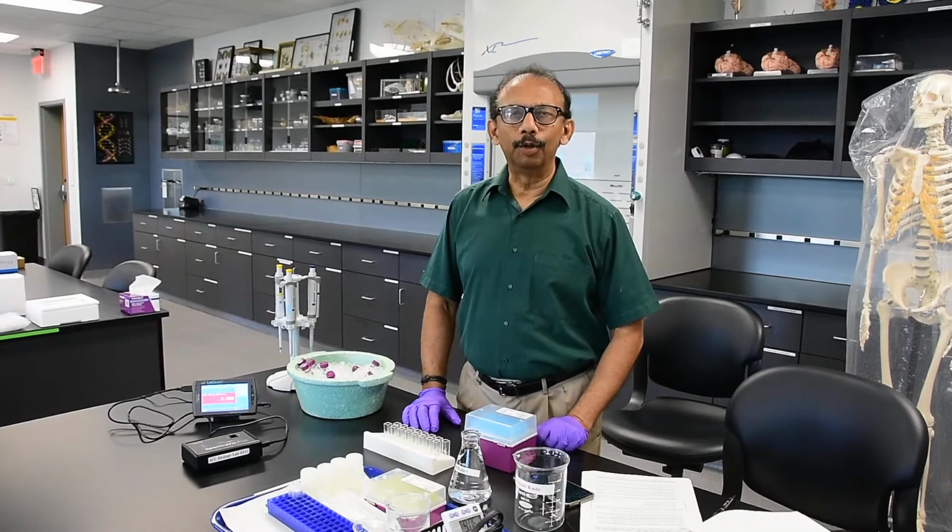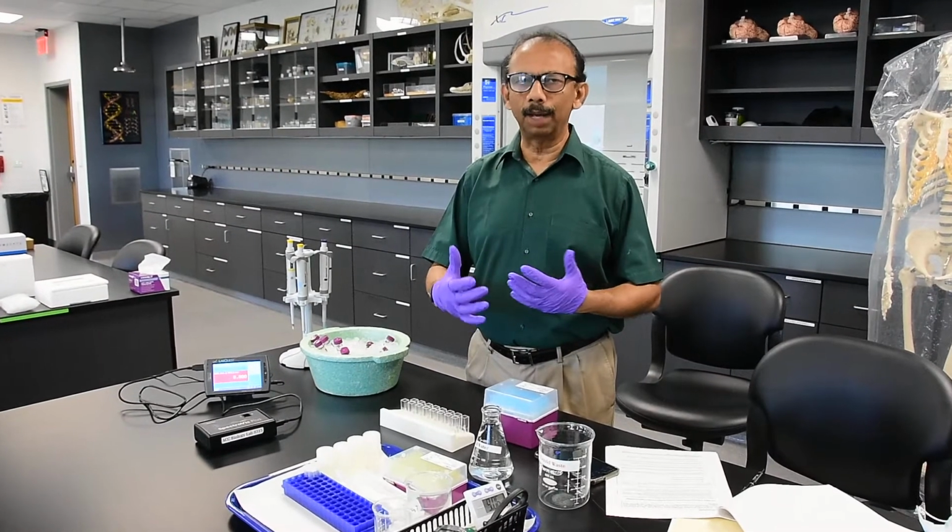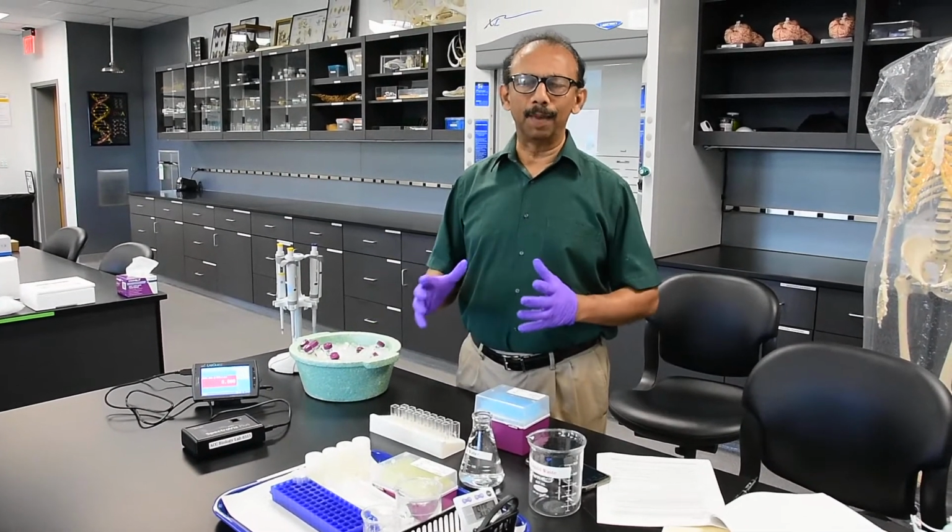Today we are going to go through the enzymes lab, a demonstration of how the enzyme lab is done, how we are preparing the chemicals, and how we are measuring the enzyme activity.